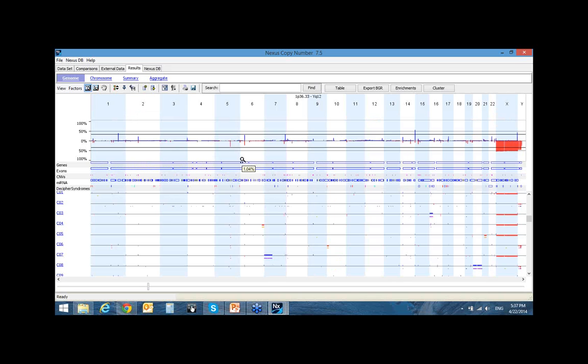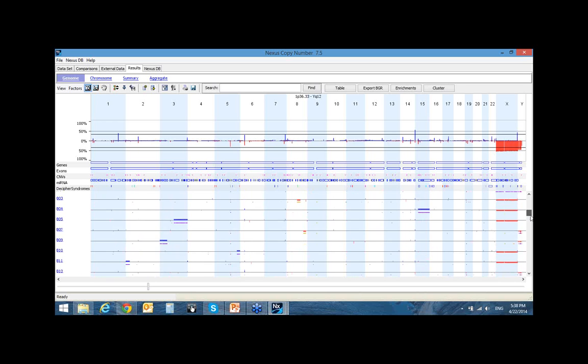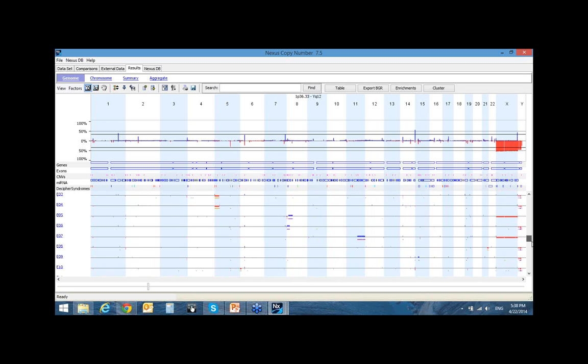As you can imagine, if you are doing some other related sample study, for example, cancer samples, you run on a plate of Axiom array plate, 96 samples, then you can see a lot of overlapping regions. For example, the breast cancer sample, you have a HER2 duplication. You can easily see that peak on chromosome 17. There is a HER2 duplication. In most of the samples, you can see that same gain. But since my samples here are not really related, I give you the idea of how you do this.